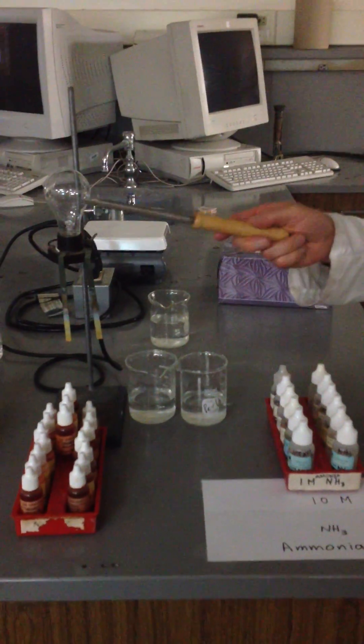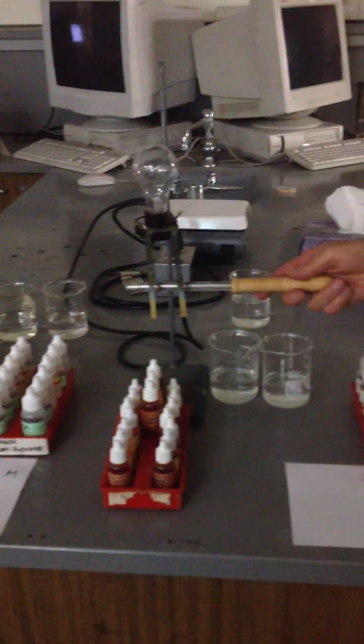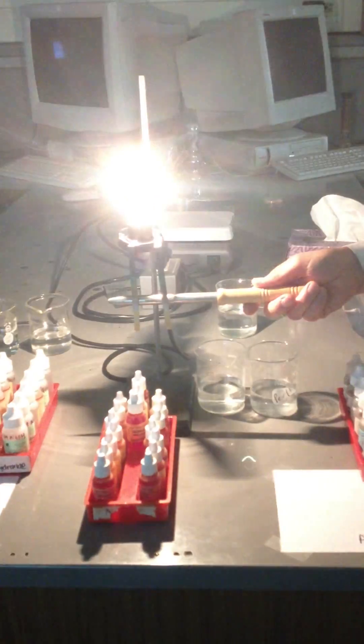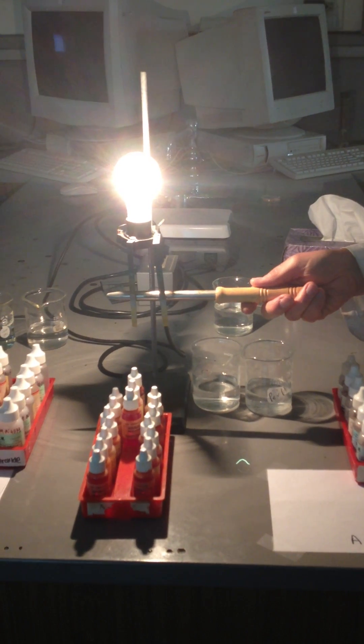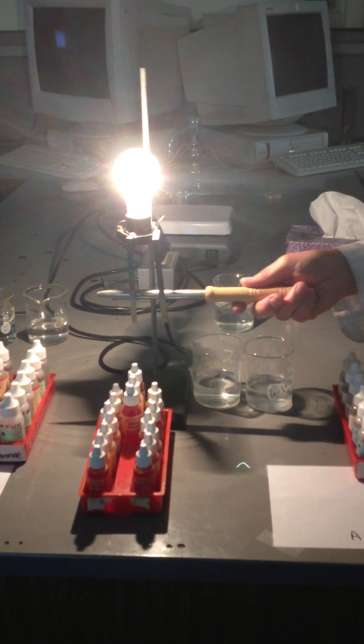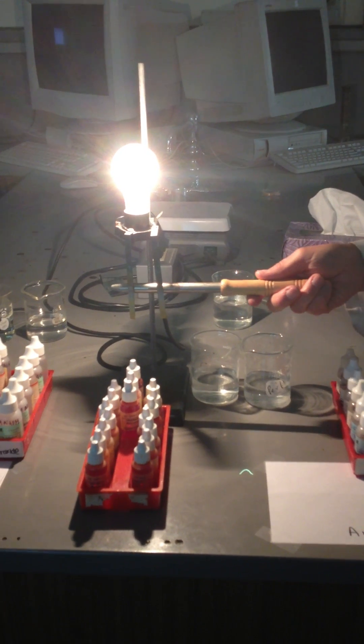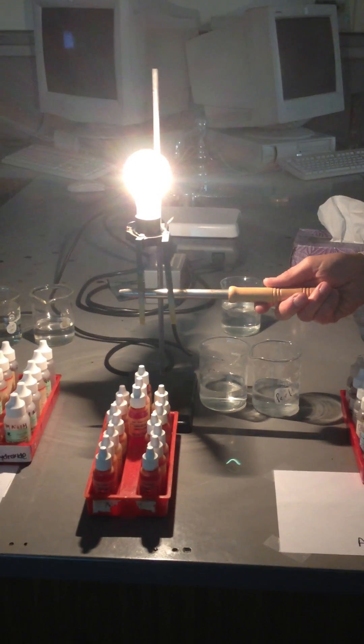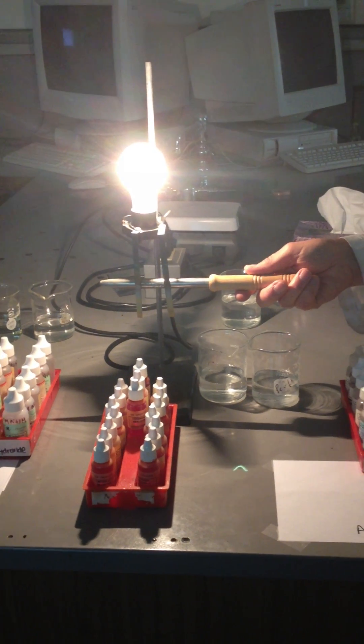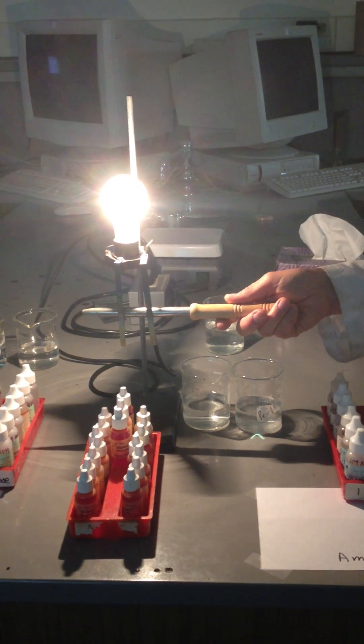What you're looking at is a conductivity tester, which is just a light bulb and some electrodes down below. When I touch the electrodes with this spatula, which is made of metal, I'm just completing a connection for the electrical circuit. And as I do that, the light is lighting up, and the brightness of this light is the brightest you're going to see.